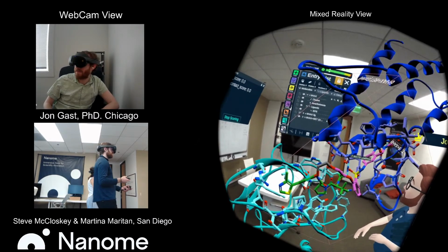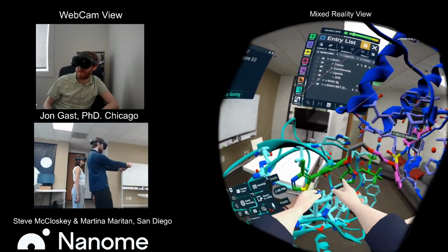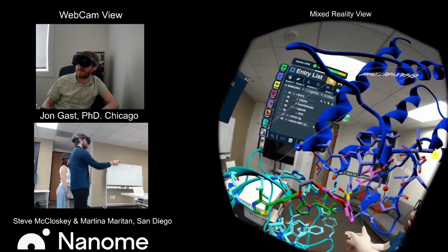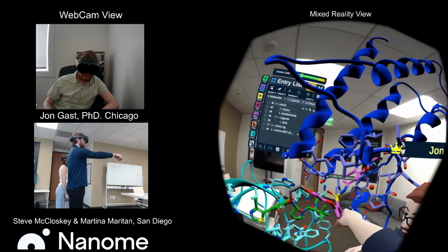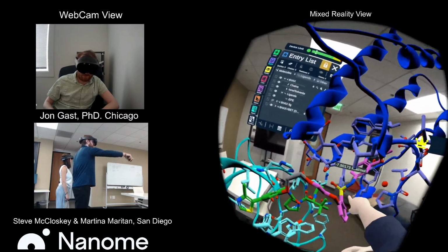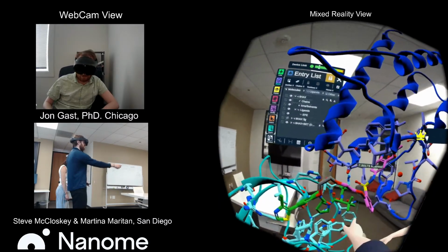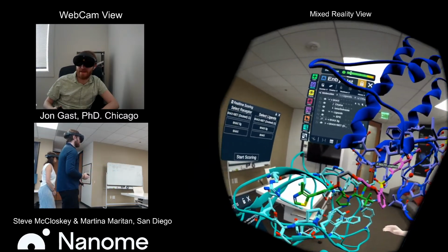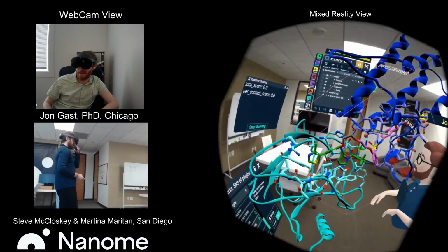And of course, we might after this want to run a full redocking of the entire structure. Absolutely. That'll give us better results because we still have the negative 7.5 kilocalories per mole of the original docked ligand over there in the pink, but that doesn't account for all the changes that we've now made with the linker. So we'll just run this again for a second, and there we go.